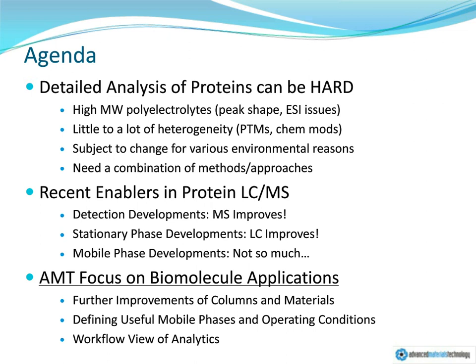mobile phase modifications. Our focus at Advanced Materials Technologies has really in the last decade centered on biomolecule applications. And a lot of this work has been concerned with further improving column packing materials and liquid chromatography columns. This is our primary commercial activity.